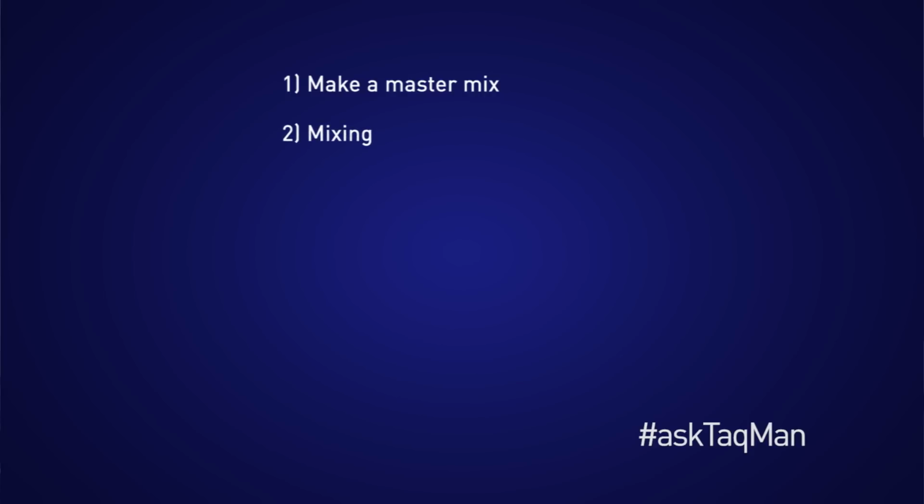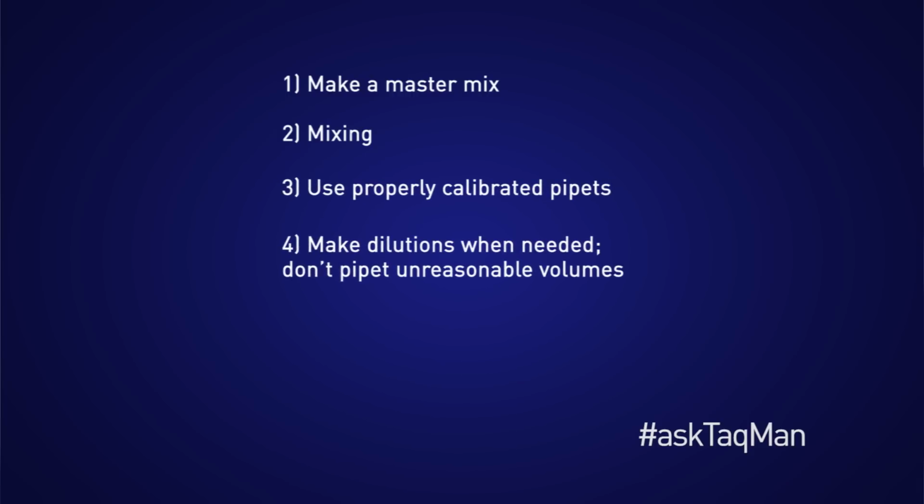2. Dispense the master mix to your sample plate, and then add your sample. Make sure to mix by pipetting about 10 times, and not to reuse pipette tips. 3. Use properly calibrated pipettes. 4. Make dilutions when needed.